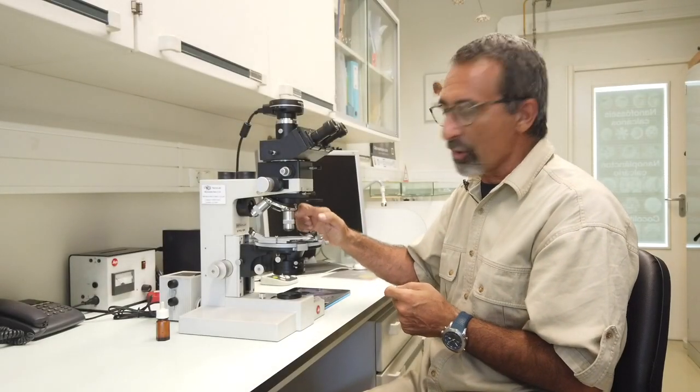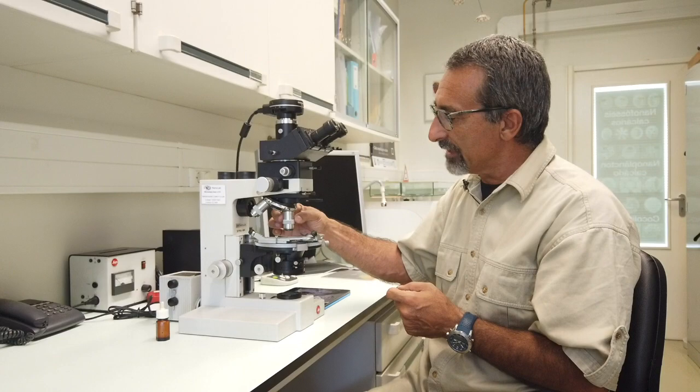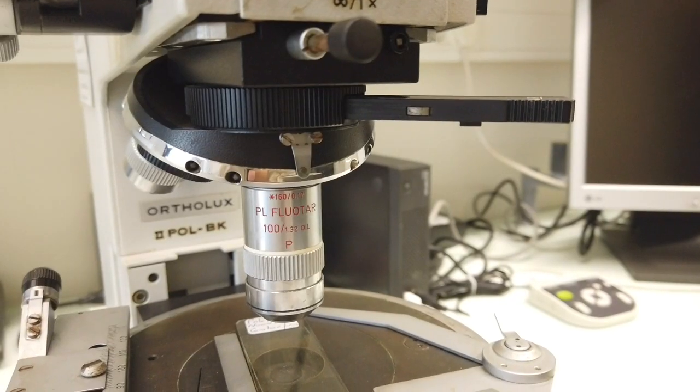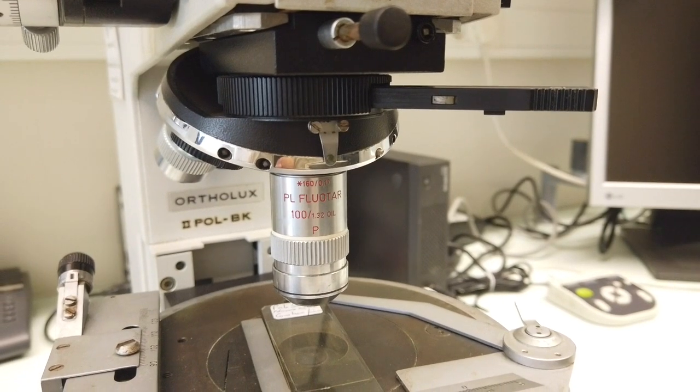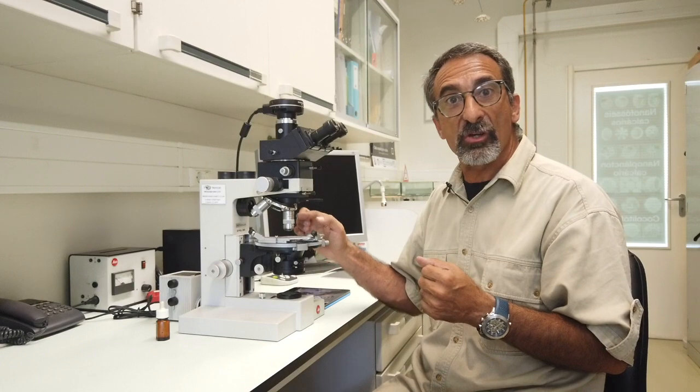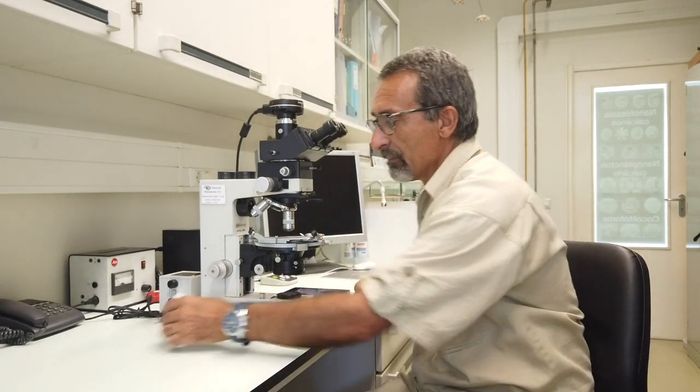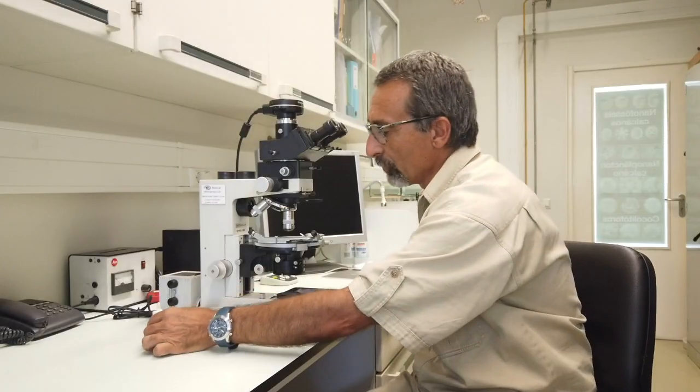Then we have an objective, an objective that magnifies 100 times. 100 times is what we normally use in our calcareous nanoplankton observations. We need a special objective that is adapted to use immersion oil and also adapted to polarize light.